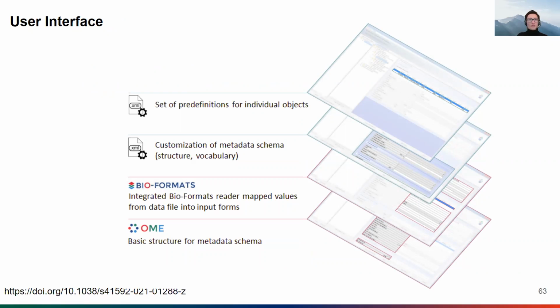A little bit about the user interface. For this metadata annotation process, we developed MDEmic to support the user in the capturing process of metadata and to enable the integration of recommended metadata standards, for example. It is composed of different components with different levels of user support.